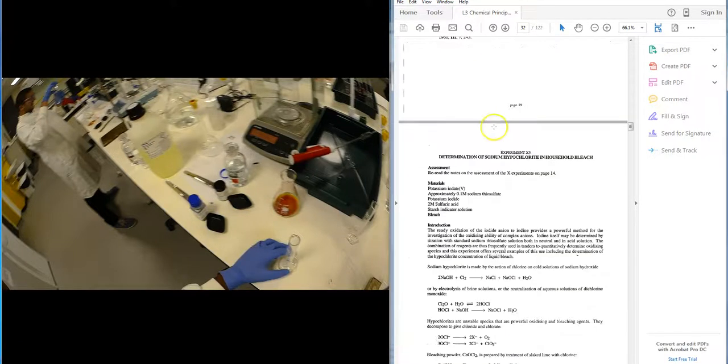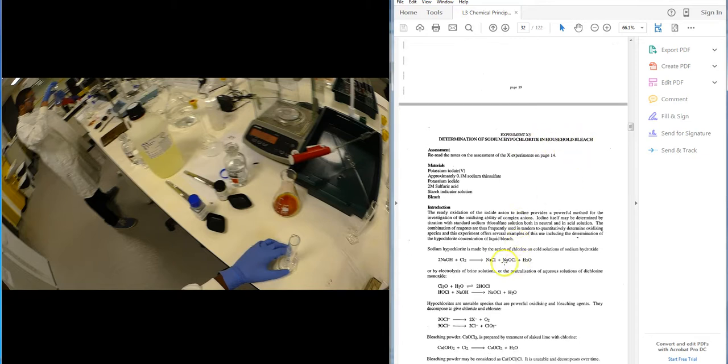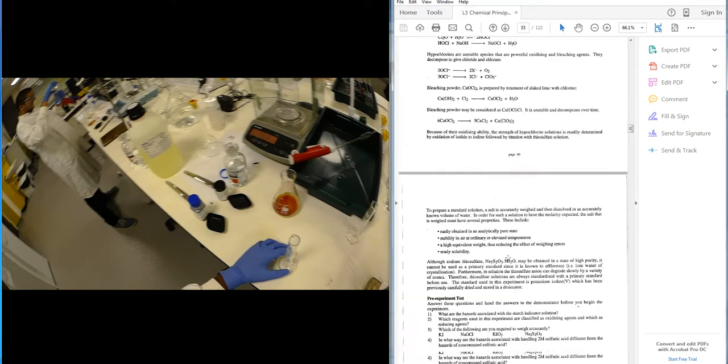So this is Practical X5, the determination of sodium hypochlorite in household bleach. The hypochlorite ion with the sodium ion here, determination of the chlorate concentration, or the hypochlorite concentration in bleach.